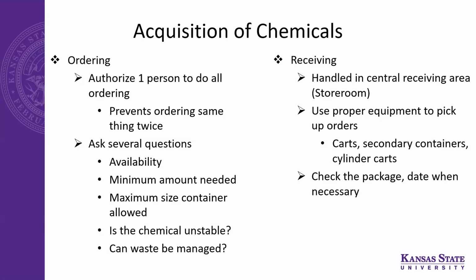For example, you are never to carry a chemical by hand. Always use secondary containers, carts, or, in the case of a gas cylinder, use the cylinder carts.